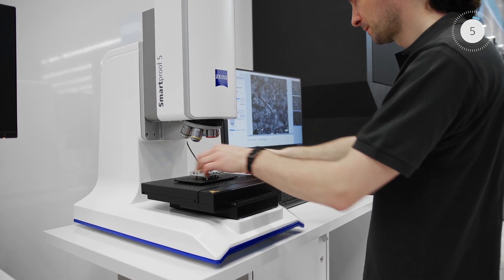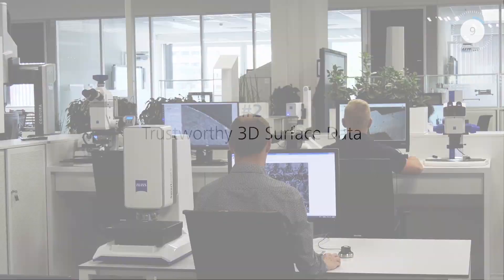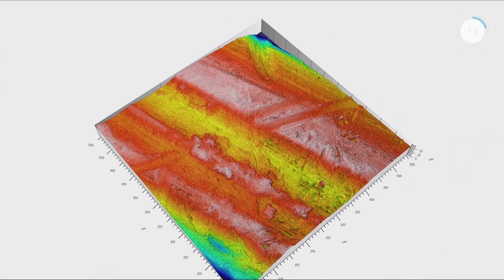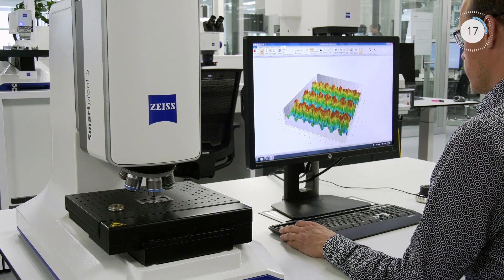Combine fast topography measurements with simultaneous wide-field imaging and documentation. Acquire 3D images of surface structures and evaluate the raw, unprocessed data for results you can trust.